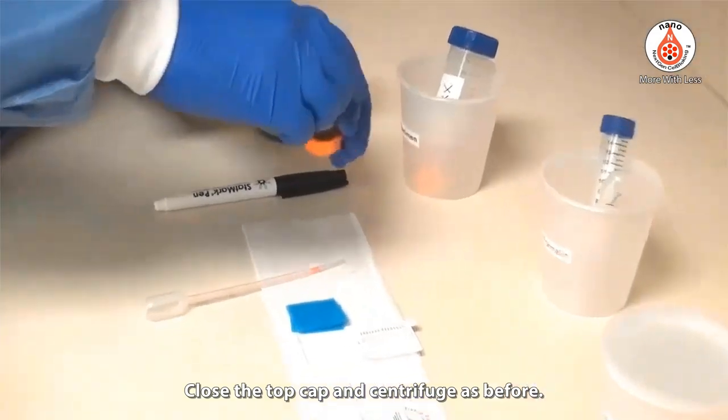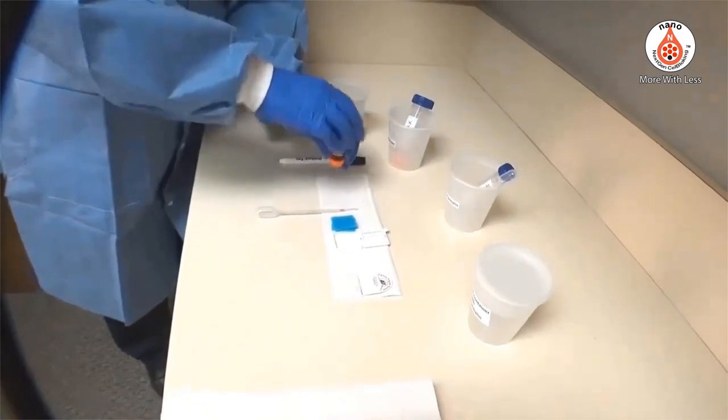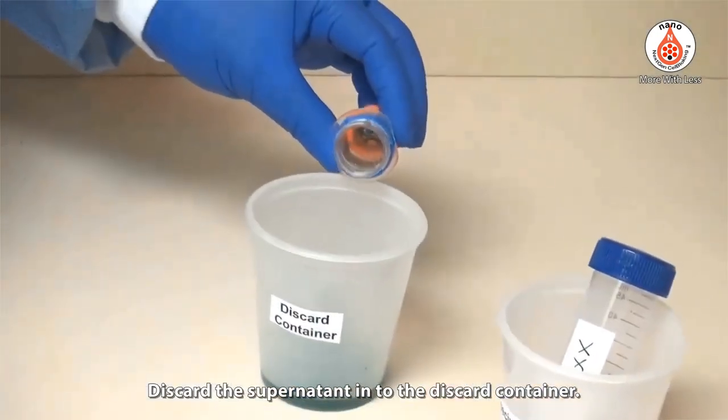Close the top cap and centrifuge again at the same settings as before. Discard the supernatant into the discard container.